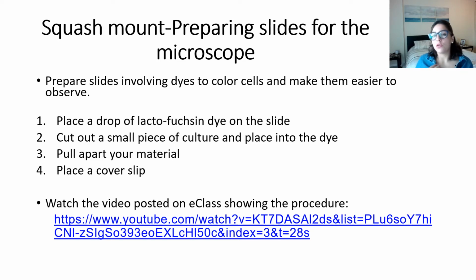I know this is not very clear when you say it in words. That's why I'm inviting you to watch the video, which is posted on eClass, and it shows step by step the procedure you need to follow to get a squash mount.